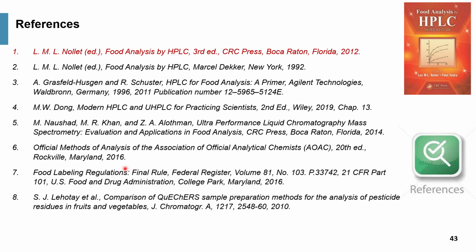So here's a reference, and I would say that the one in red is the most important one, which is the Bible on food analysis by HPLC.